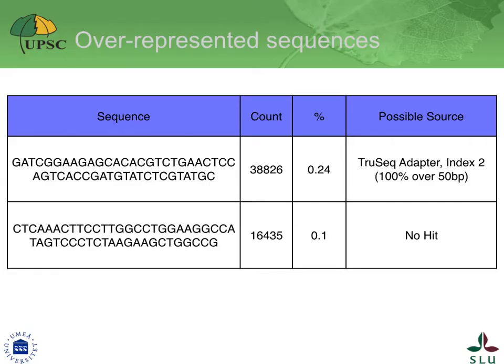A third element of importance in the FastQC report is the table of overrepresented sequences. These are sequences that occur more frequently than would be expected by chance. Note that FastQC was designed for assessing DNA sequencing, where coverage would be constant across all sequences. For RNA-seq, the situation is different, as some genes can be so highly expressed that they account for millions of reads, and could hence appear overrepresented. Here, this may be the case for the second line. The first line is a sequencing adapter. From these combined results, we know we need to trim the reads using a quality-based cut-off, remove adapter sequences left over, and investigate what the unknown sequence is.